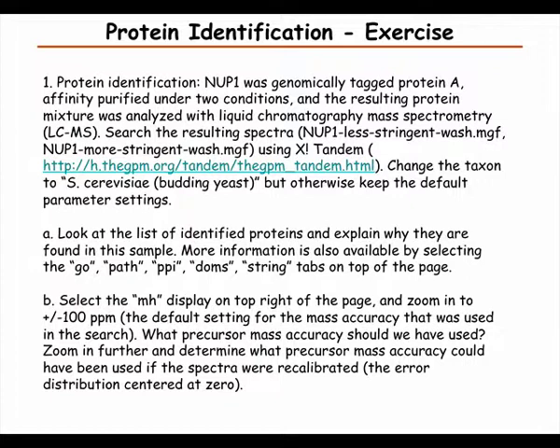But also, in general, old reagents. So it's good to make new reagents all the time. But it's almost impossible to avoid getting keratin in there. And trypsin, there's some left of the trypsin that you added, of course.